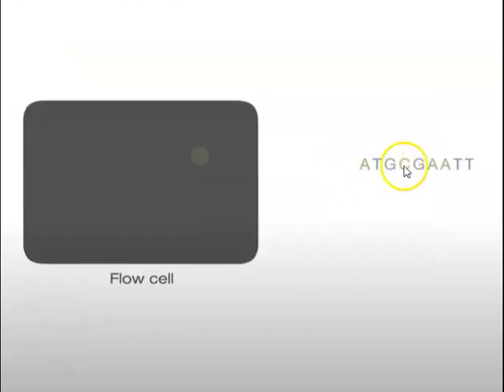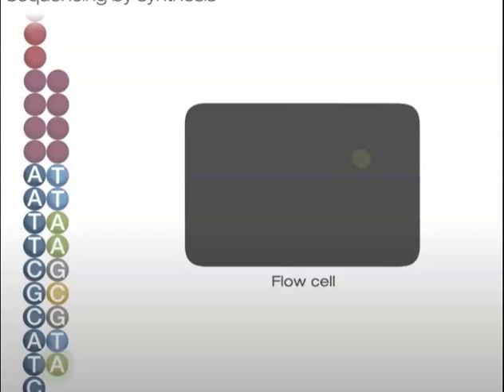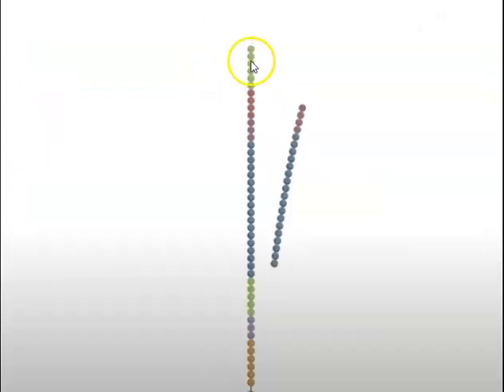And the sequence is accumulated from that particular sequence. So if we just move that back across, that's the sequence that's been generated coming from that sequence there. Okay, so we have read this piece of DNA, we've generated this piece of DNA, and we've sequenced it, and that's why it's called sequence by synthesis, because as we sequence the DNA, we effectively read the sequence.